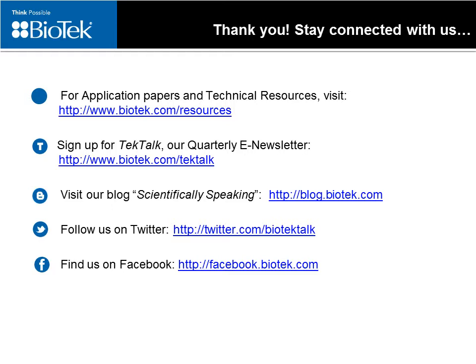Does this technique require specialized plates? I covered this a little bit, so it really doesn't require specialized plates. There are certain requirements. You do want an imaging grade microplate to really get good resolution, but there are a variety of options available for that.